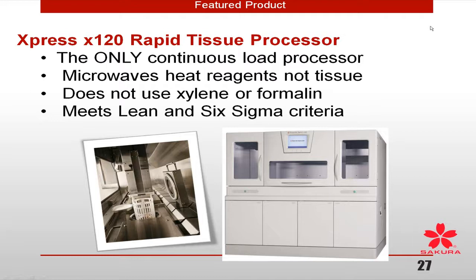Every PA who goes through their training and every pathologist is trained to do the nickel. If we could get everybody to get a nickel size, the same size, volume and thickness, consistently, I think all of our processes would work better. So there is resistance. It takes management, and it has the same issues as any change and learning a new process.